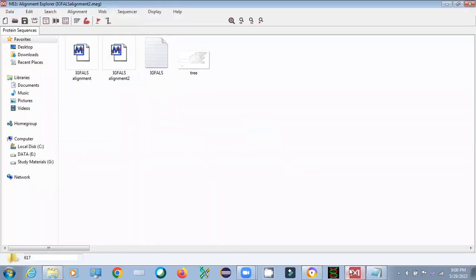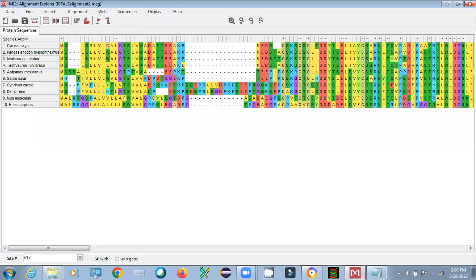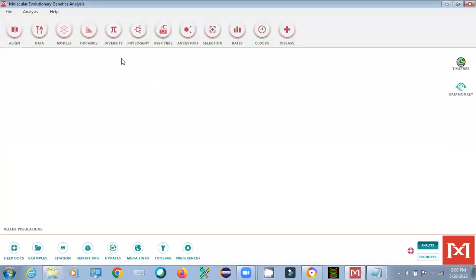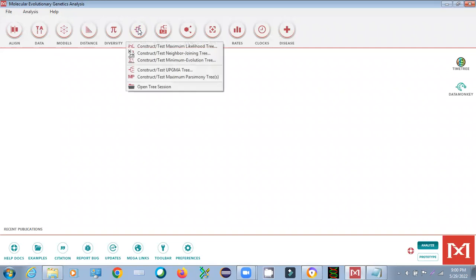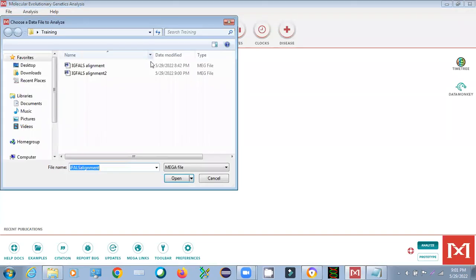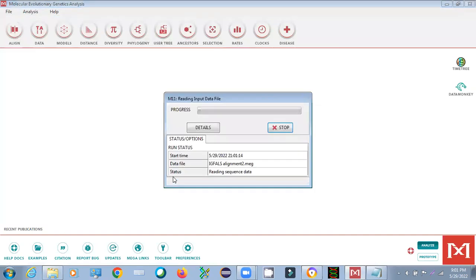Go back to the main MEGA page. You will see a 'Phylogeny' option — select that. There are many tree-building options available. For publication purposes, we generally use the Neighbor-Joining tree method. Select that option, then navigate to your folder and select the multiple alignment sequence file you just saved and open it.